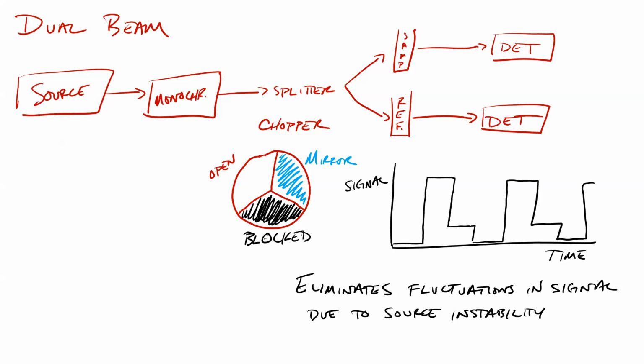You have to have detectors. Most of them these days have dual detectors rather than recombining them. And so you have to have detectors that are matched in terms of their response, so that one isn't amplifying by an extra 5%, which would throw off your comparison between the two. You have to make sure that the light in each path travels exactly the same distance, so that they both reach the detector at the same time, whether it's going through the sample or through the reference.